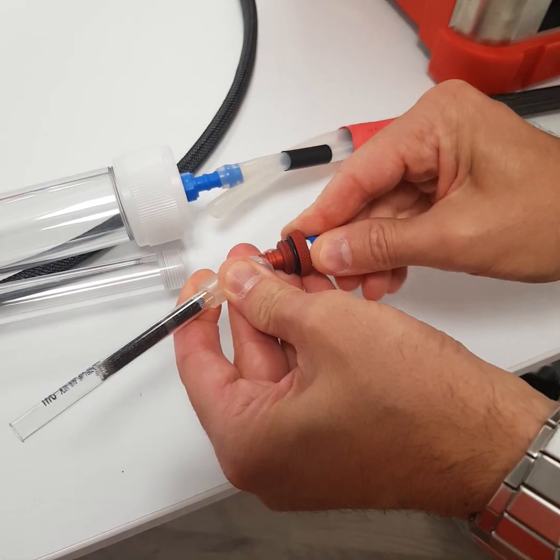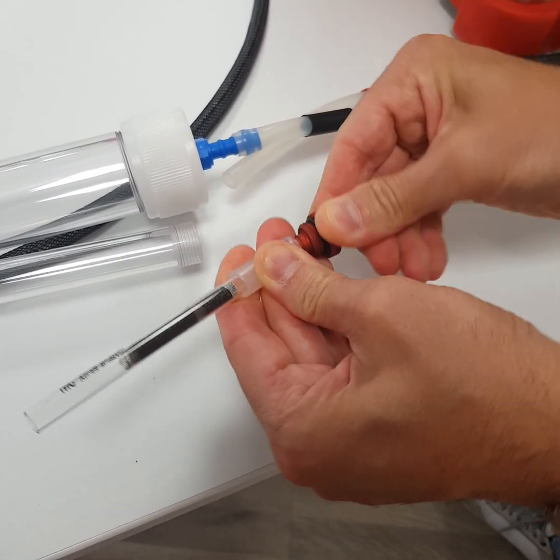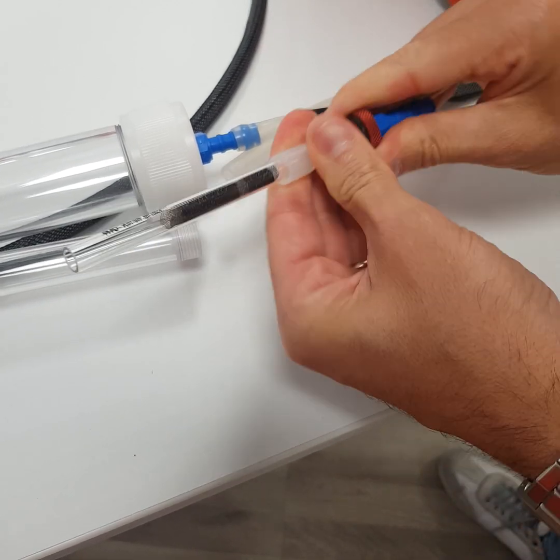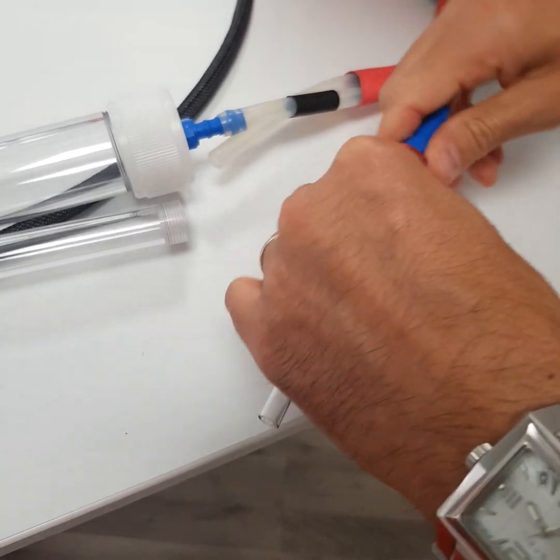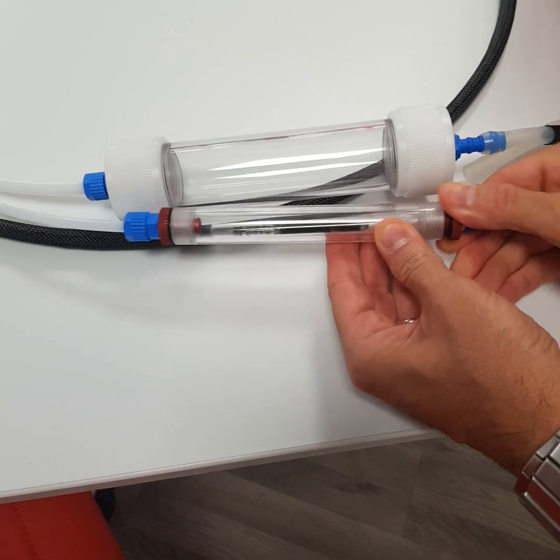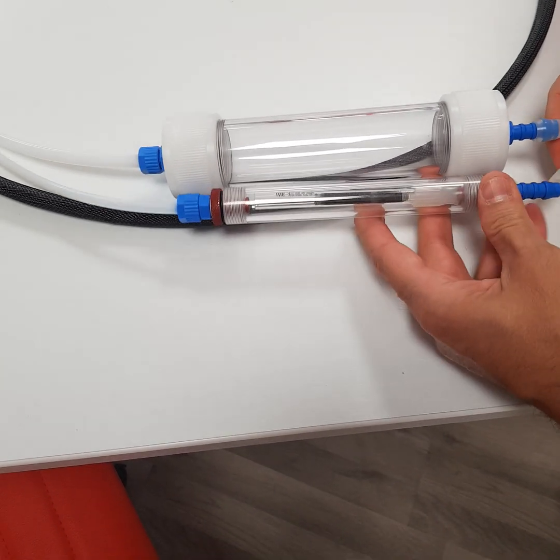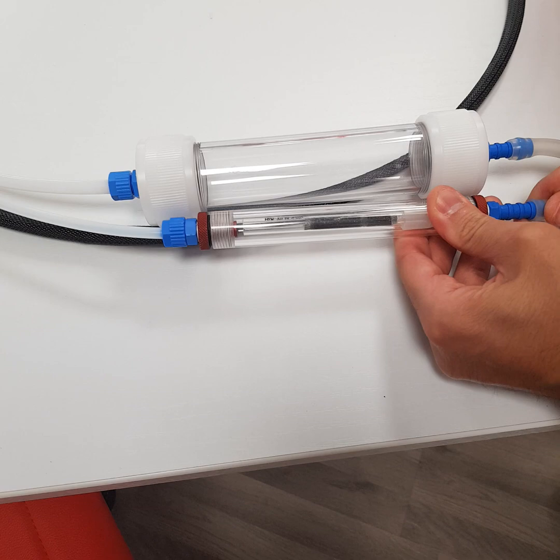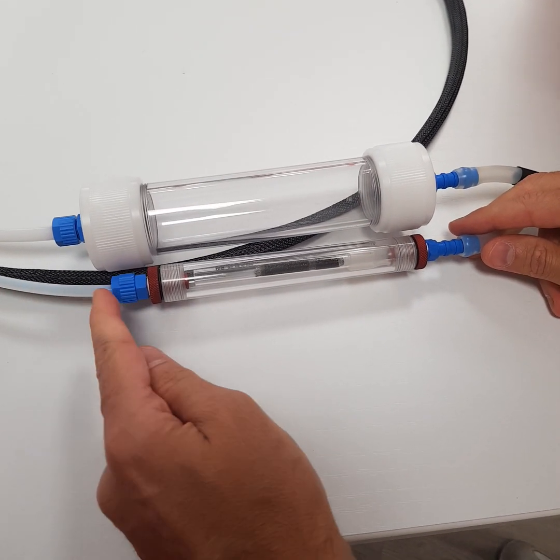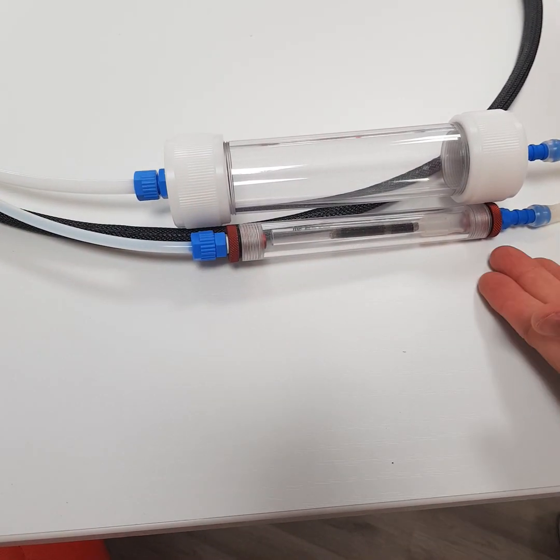Then it should be necessary just to plug together, close tight, and then connect again. Please check that the Teflon line is from here, so no other pollution could come inside.